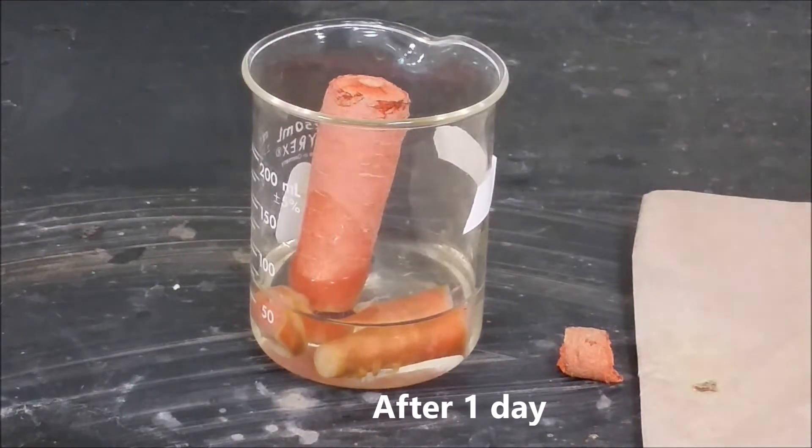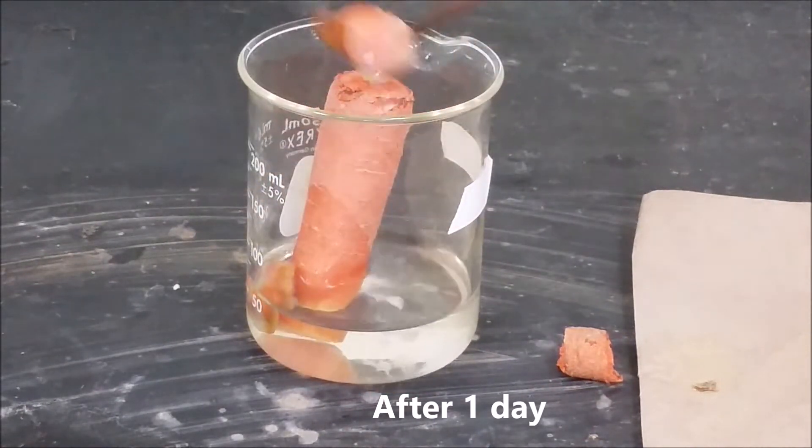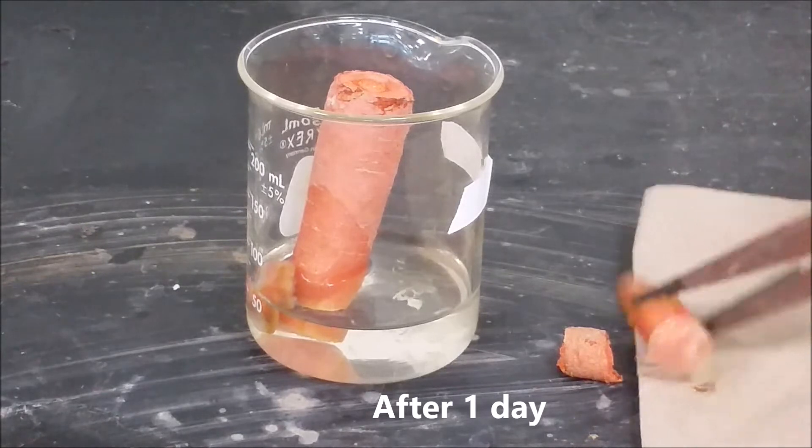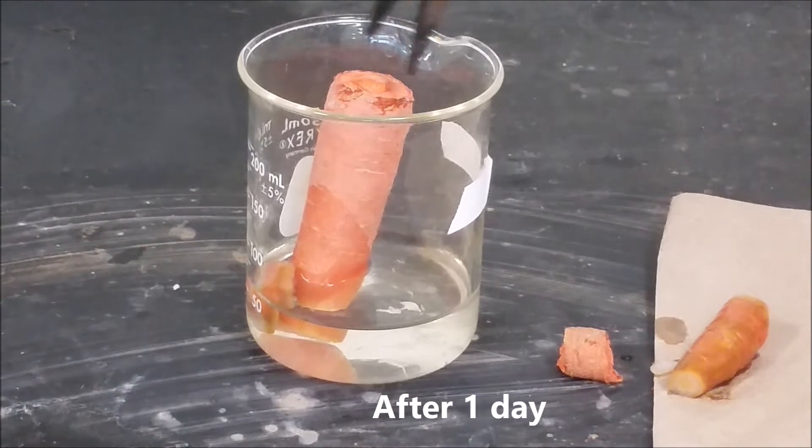The carrot is still orange, but there are spots that are white relative to the rest. Some of the smaller chunks are now white.